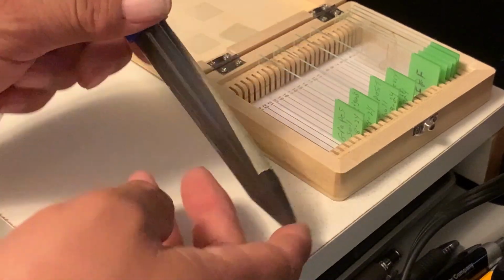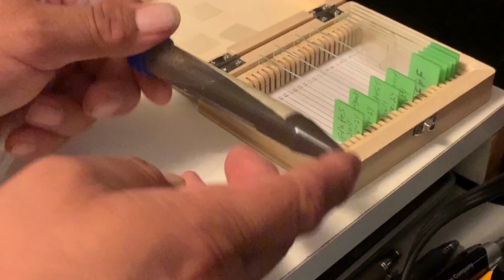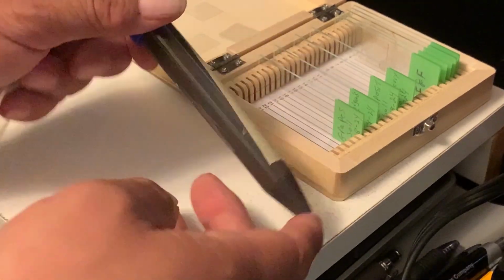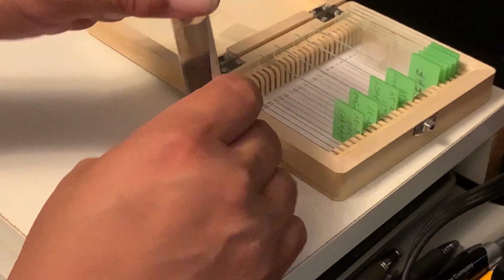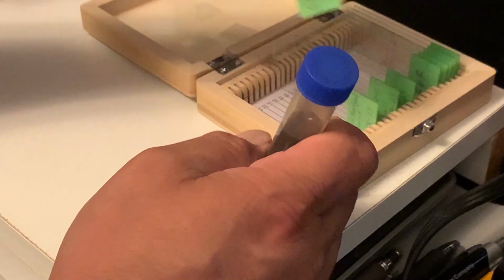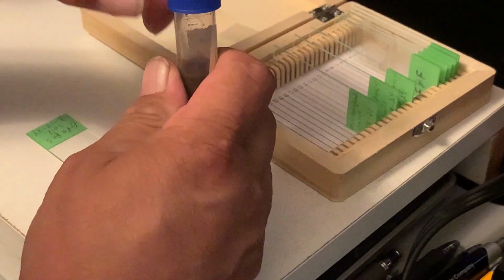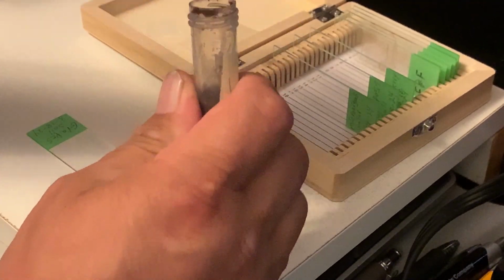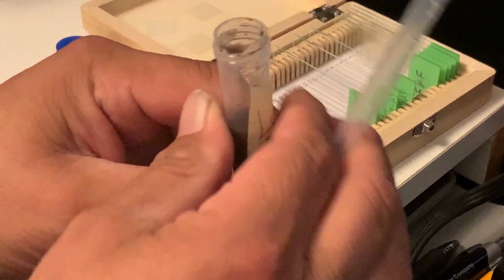Now, I think we're going to put all of one on the slide, and then I have to set up the camera again so you guys can see. All right, that should be good. Here's the grape. Not make a mess.